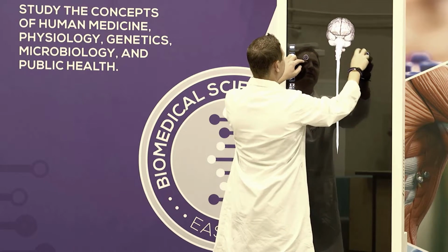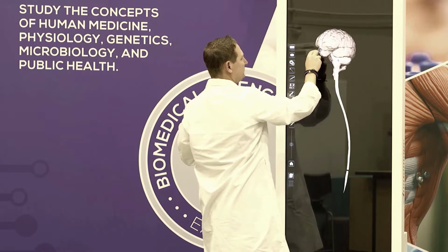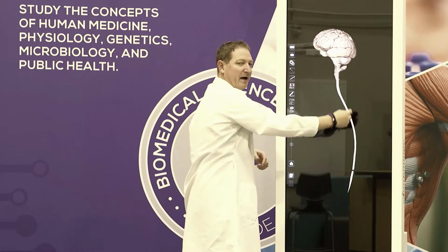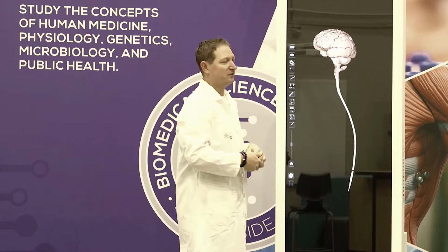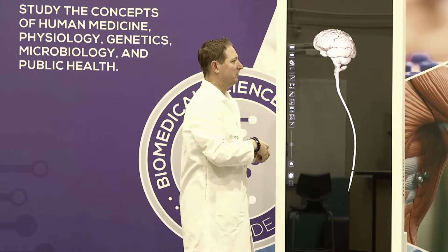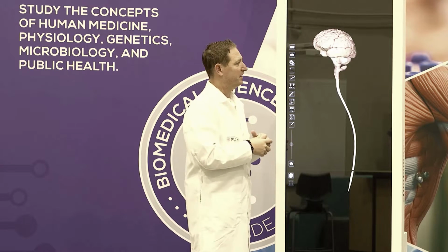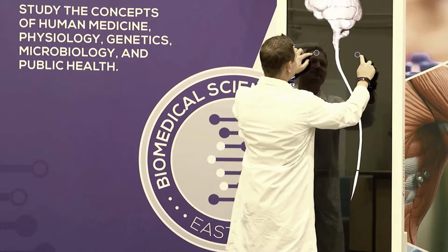Now, what you'll notice in this central nervous system for a human is that here's the brain and the spinal cord comes directly down. Because we're standing on 2 feet, the spinal cord comes out the bottom of the skull. In the sheep brain that we're going to dissect, you're going to see that it comes out the back because the sheep is on 4 legs. Let's take a closer look at the different lobes and parts of the central nervous system.